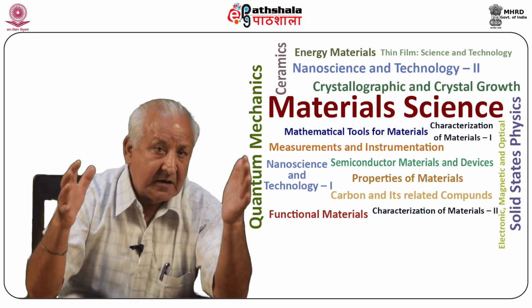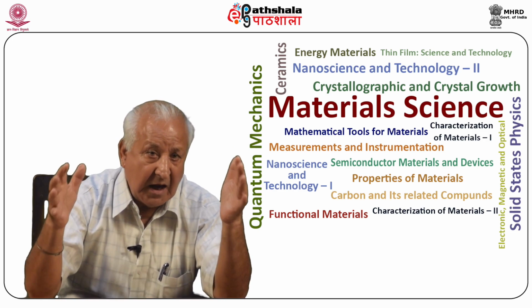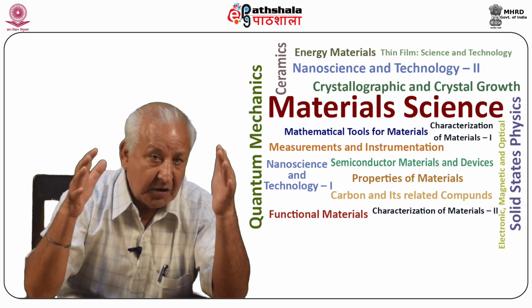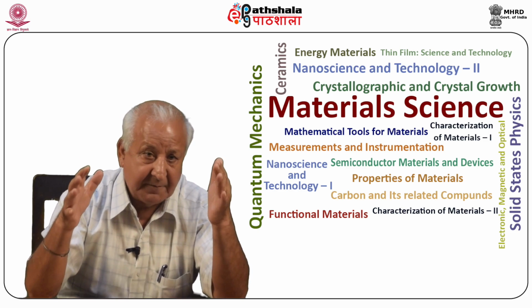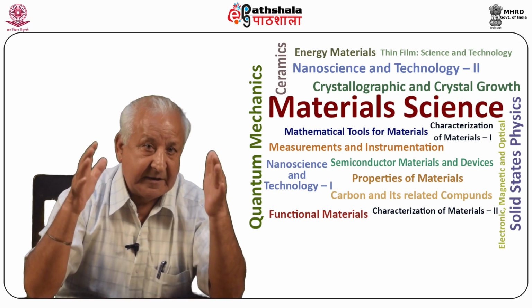There have been several innovations in the development of crystallization apparatus from time to time, as will be discussed in the relevant section. However, the basic crystallizers commonly used are shown in the schematic diagrams of figure 27.1. In one case, we have a single tube, and so it is known as the single tube technique.